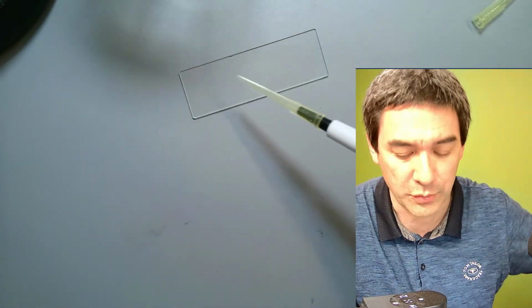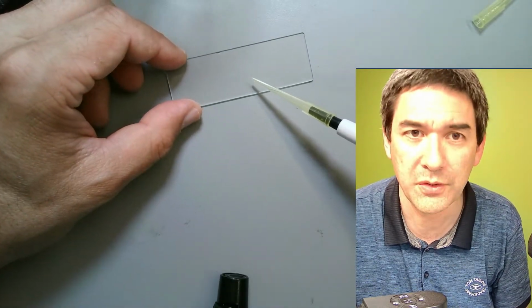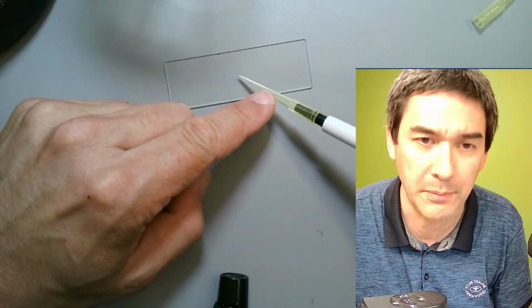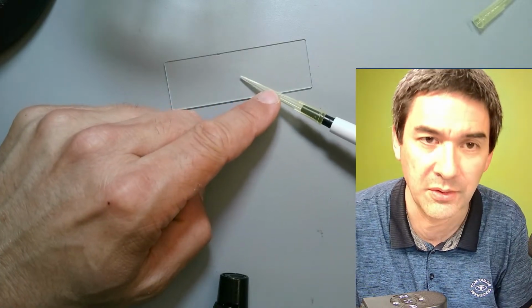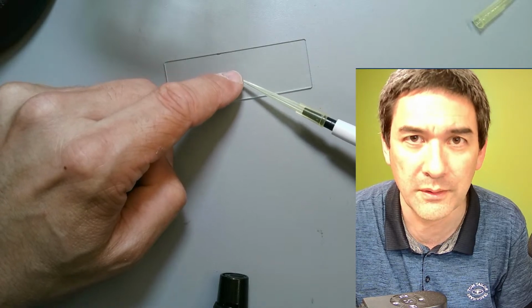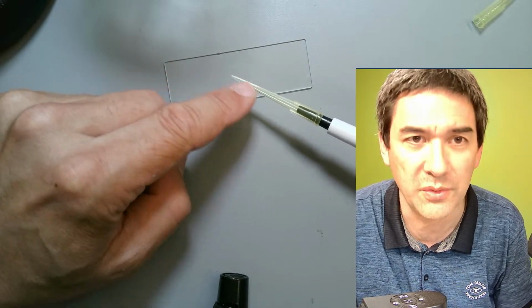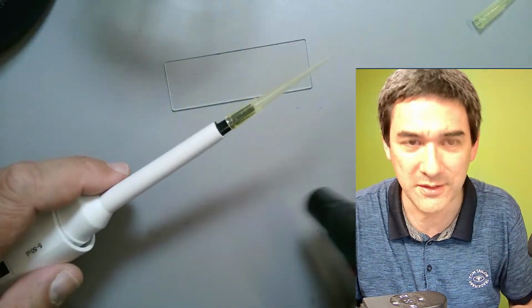I'm going to show you a little trick. Sometimes it can be a little bit difficult to pick up individual objects here, because the angle is too flat, and then the tip is not submerged in water. So what you want to do is have an angle downwards. And look what I'm doing. This is going to scare you.